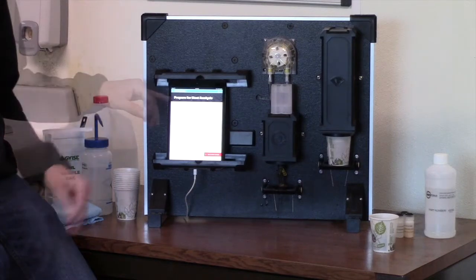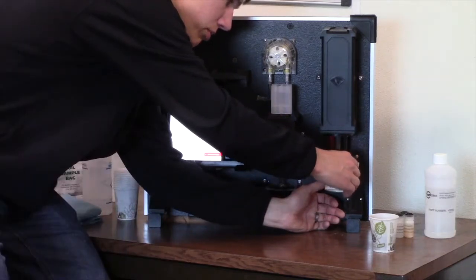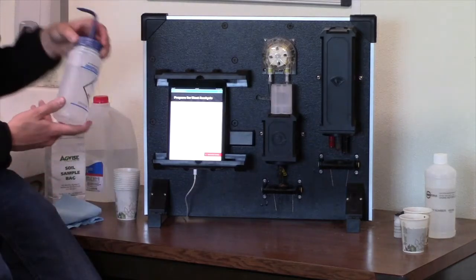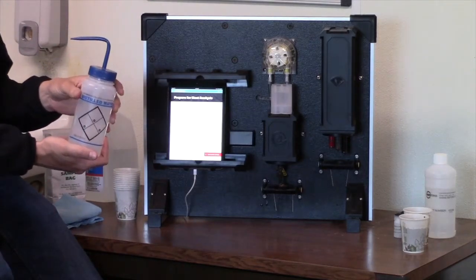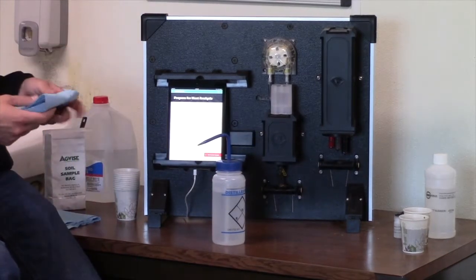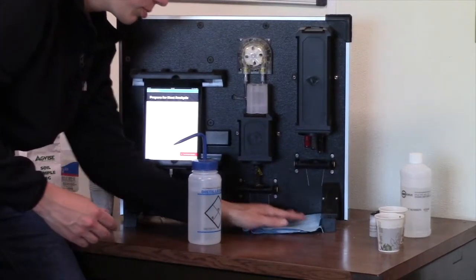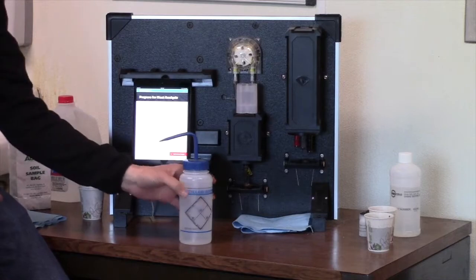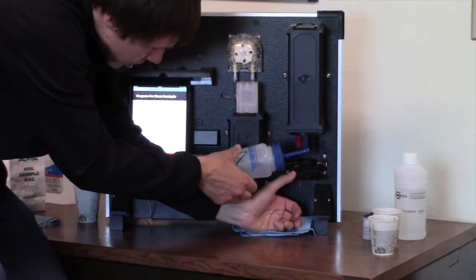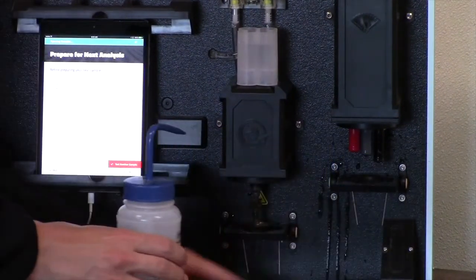So for cleaning the device, we need to take our soil sample, remove it from the sensor shelf, grab our squirt bottle filled with distilled water. Now if you're in an office setting or maybe a shop workbench, you might want to put down a towel below the sensor shelf to absorb some of the water while cleaning. But when cleaning these tips, we just simply spray water onto the sensors and let the water drip down into our towel underneath.